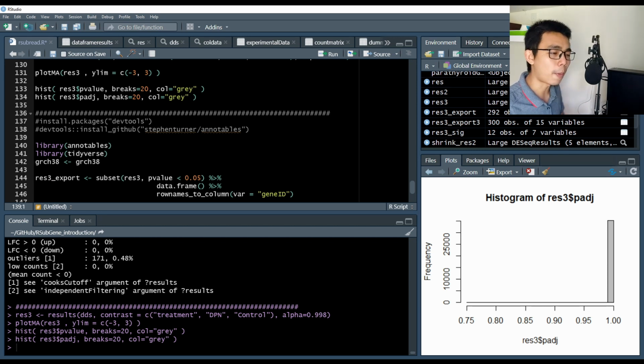Okay, so now it's the point where you maybe want to rethink your experimental design, or it might be very good for you, because your treatment doesn't affect the cell and it might be safe to use. So it depends on what you are looking for.